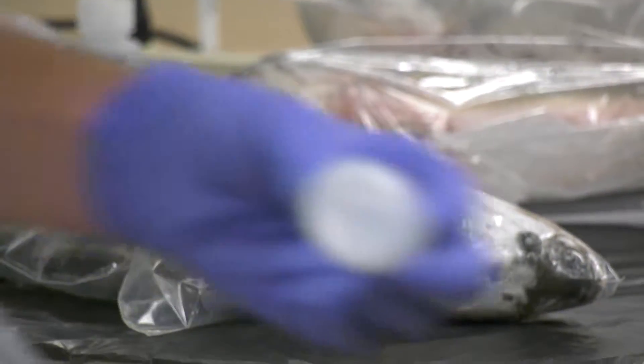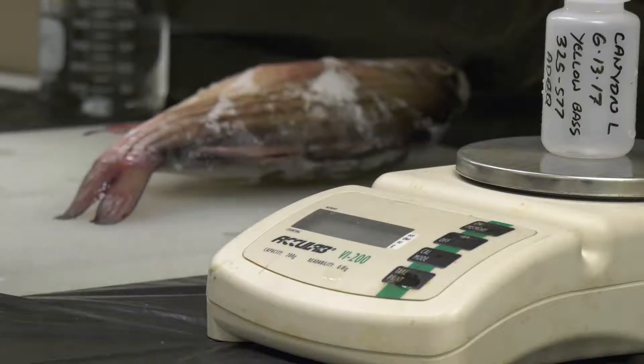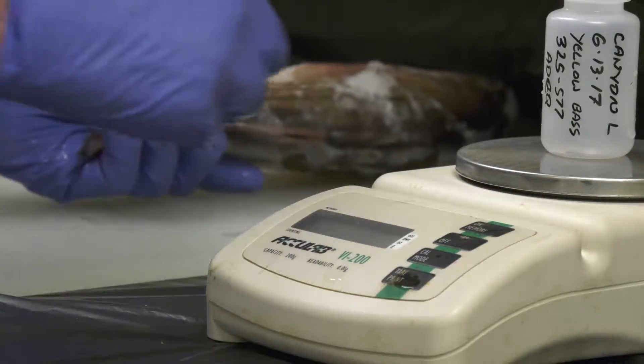We try to start with the smallest fish we got. We grab the fish and make sure we have the right bottle. We freeze them first because it makes it easier to fillet and easier to use a bio-punch. Yeah, they are pretty frozen, but they'll do fine.